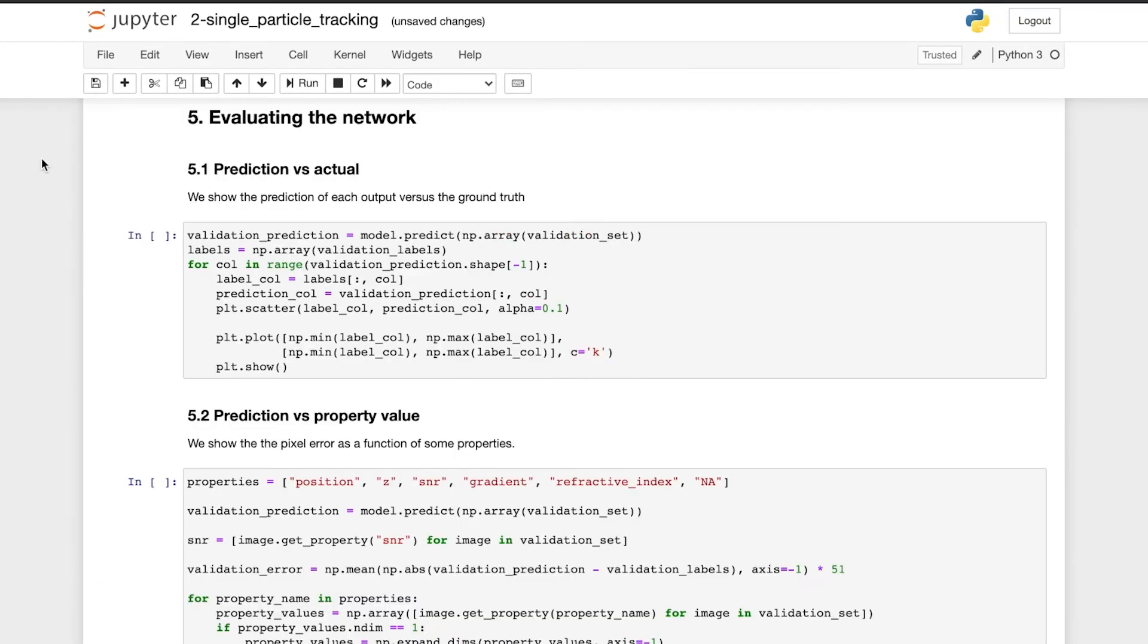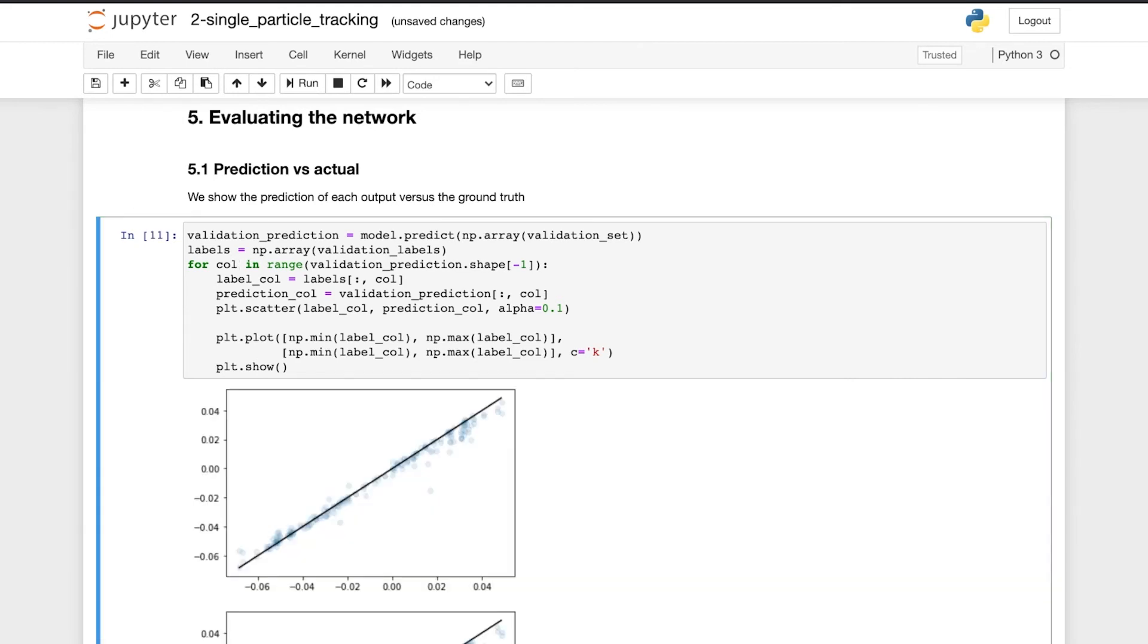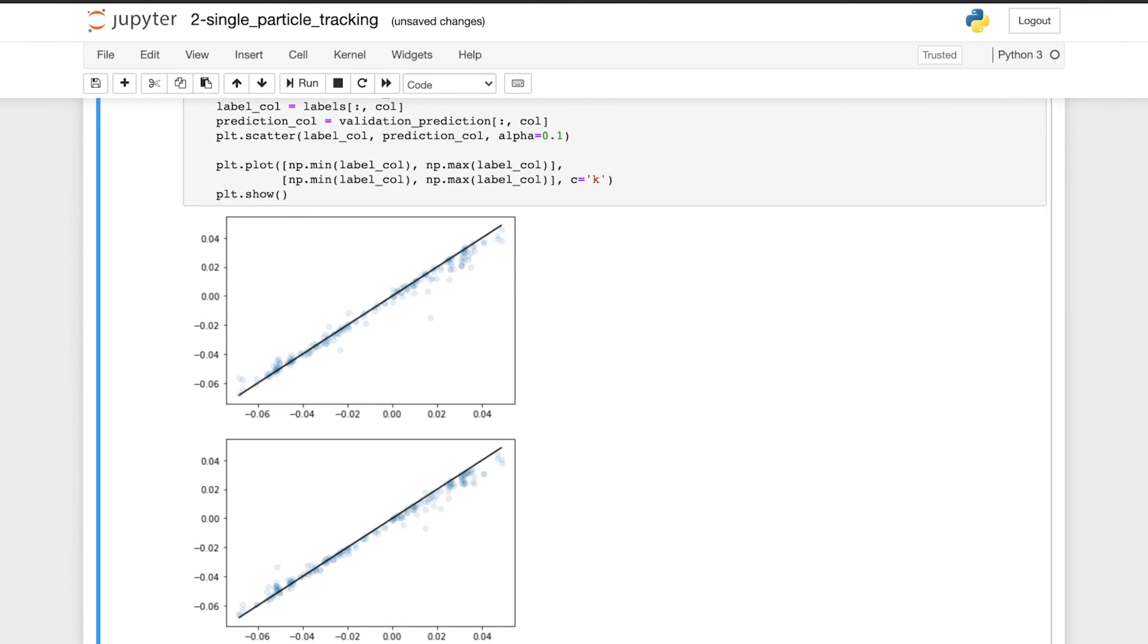And now we evaluate our trained network. First, we test the network on simulated images that are generated in the same way as the training images, but they are not the same images as are used in the training. Here, we show the prediction of each output versus the ground truth value for the x and y coordinate.